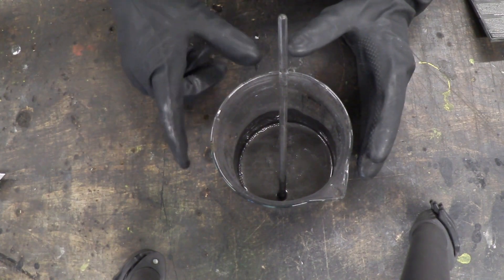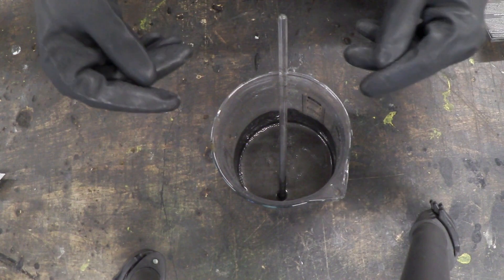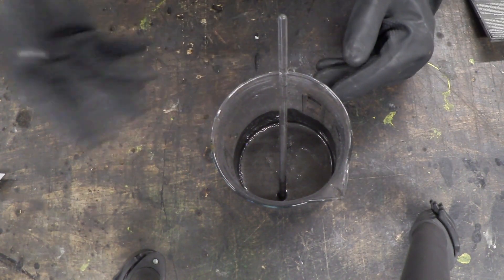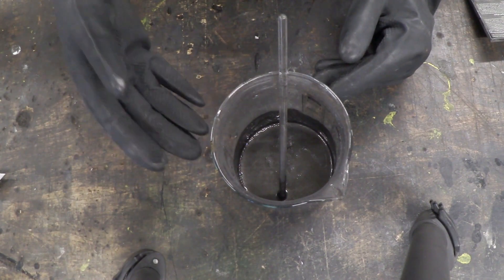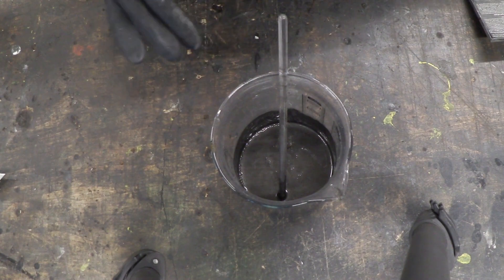Because if you don't stir it like crazy, those little bits that you add will get localized heating, and it'll begin to pop and fizz at the local point. So you need to get it stirring, add a little bit, keep stirring it, and keep your eye on that temperature to make sure it isn't getting above 40 to 50 degrees centigrade.